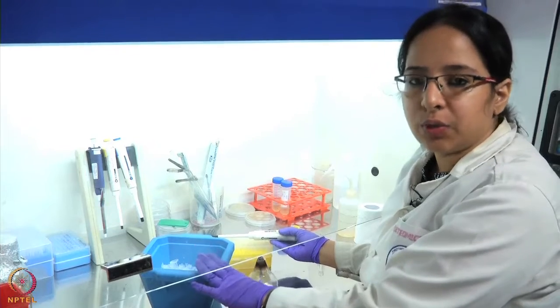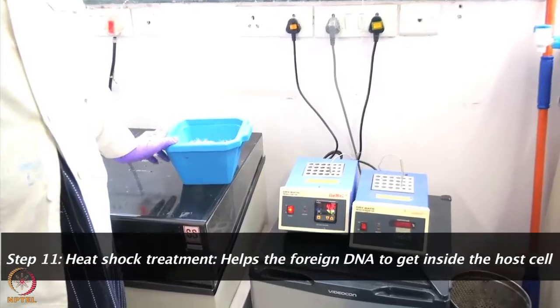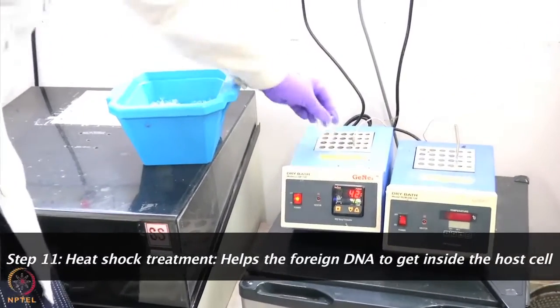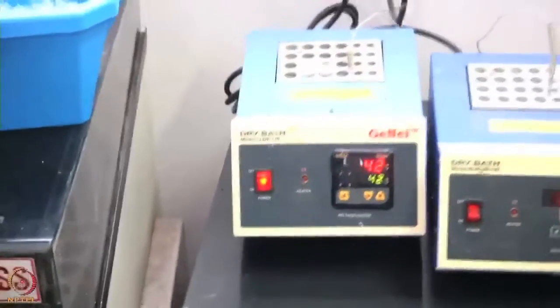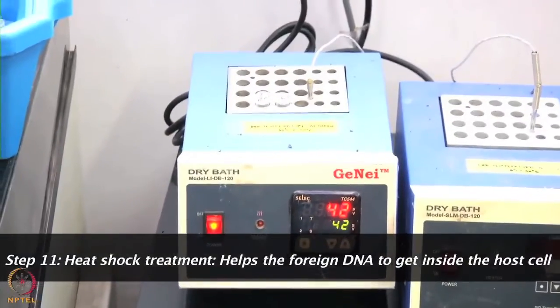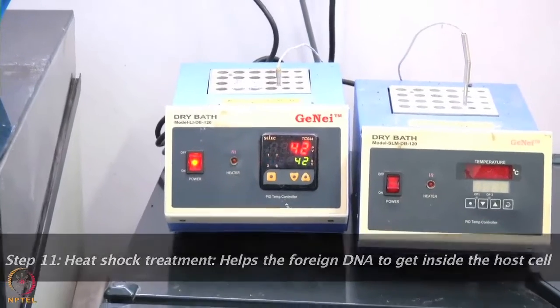So now we will incubate the tubes on ice for 30 minutes. Now we will give the samples heat shock treatment. We'll keep the tubes at 42 degrees Celsius for 2 minutes. This heat shock treatment helps the foreign DNA to get introduced inside the host cell.